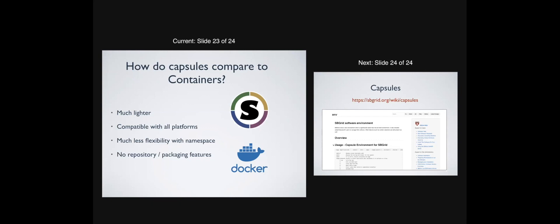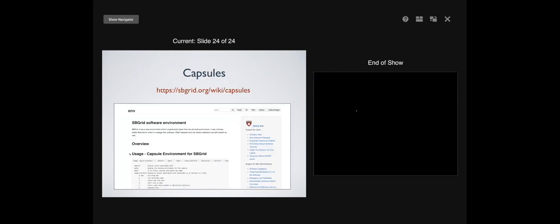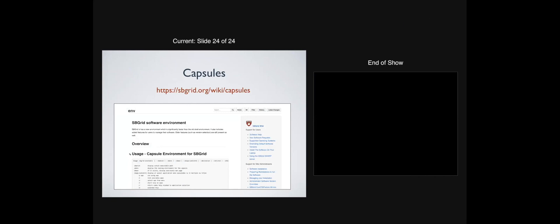After you source sbgrid.shrc, you're ready to go. If you're interested in more information, we do have a wiki page on capsules at the sbgrid.org website. I totally appreciate feedback. The wiki page actually shows you the full help, and there are features I didn't cover. Any questions?